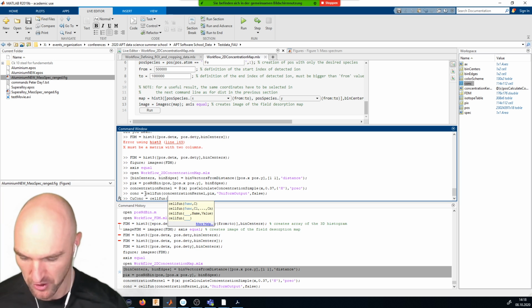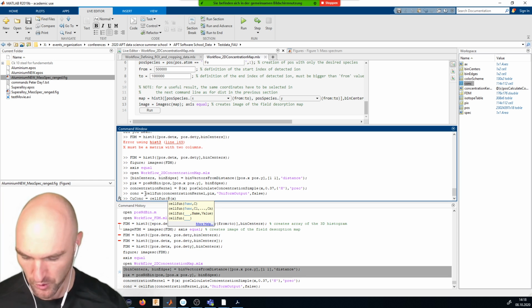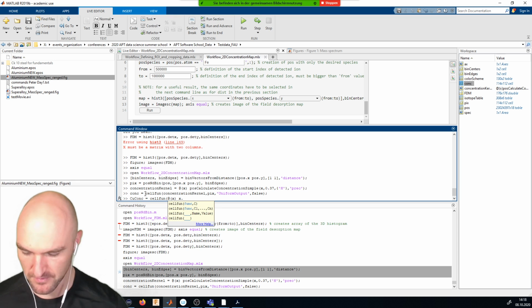And in this case, we are creating an anonymous function in there. Bear with me, it's not as complicated as it sounds right now, but we are going to say add x, and x is essentially each cell. Each cell is one of those x's, and it's going to be x dot, what do we want to do?